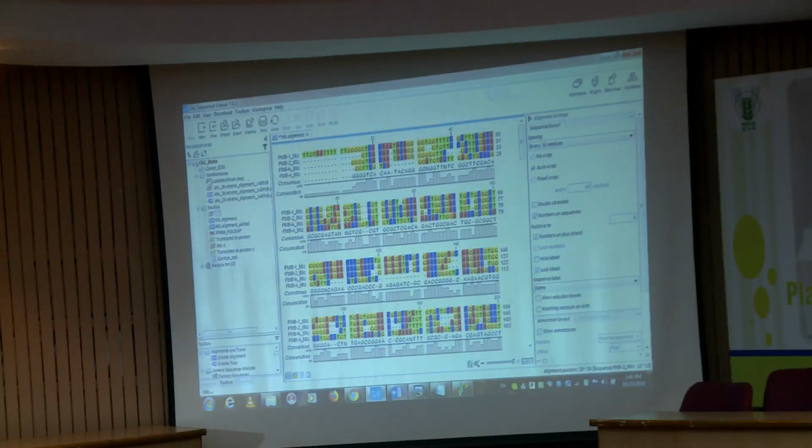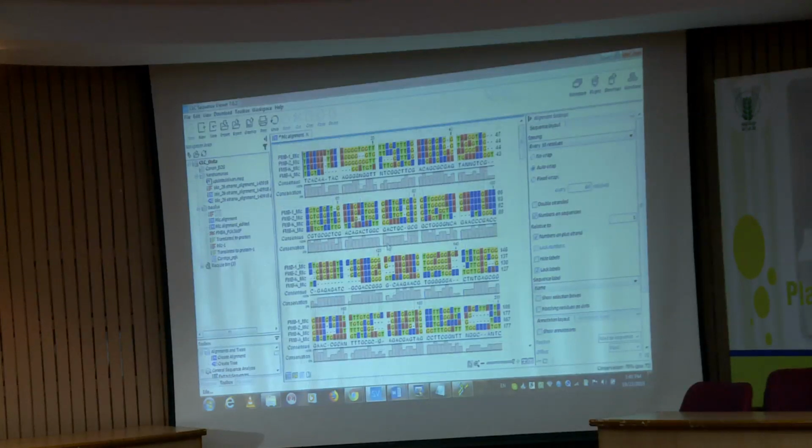Correct? So, what I will do is select the sequence. Suppose here to here I selected. From now the T is getting uniform, for example. So, now this T is uniform. I will select all the sequence, right click, delete selection. So, now what happened? The non-uniformity is cleared. Now, all bases are starting from one point, right.